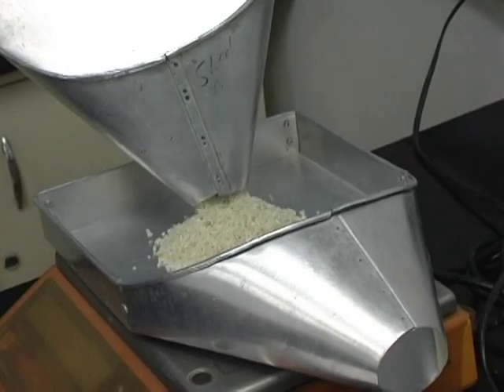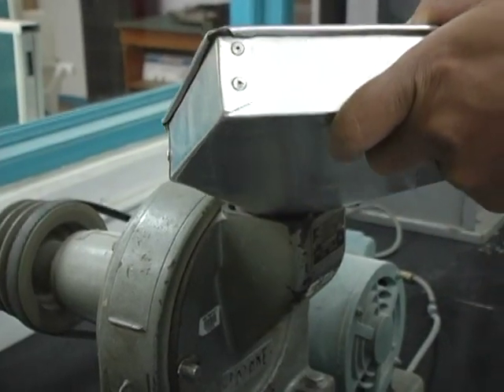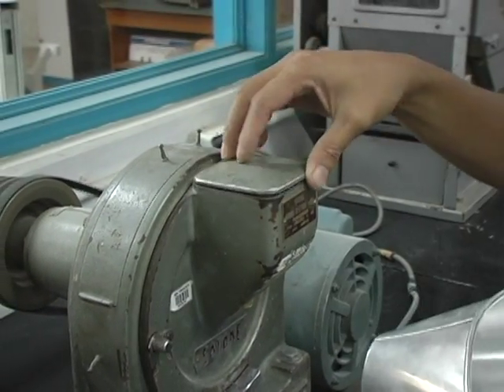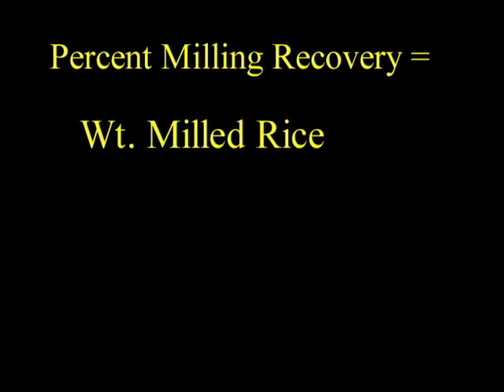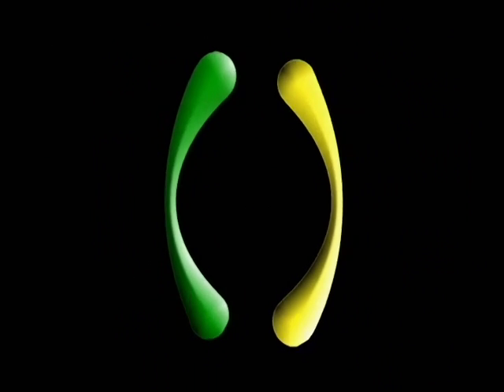Milling recovery refers to what percentage of the grain weight remains after milling the paddy. Using the abrasive whitener, mill the dehulled samples, then compute the milling recovery by dividing the weight of the milled rice recovered by the weight of the paddy sample used and multiplying this sum by 100.